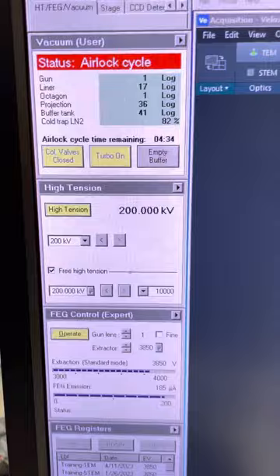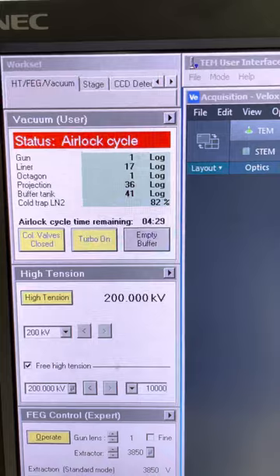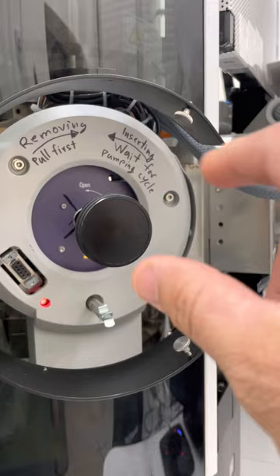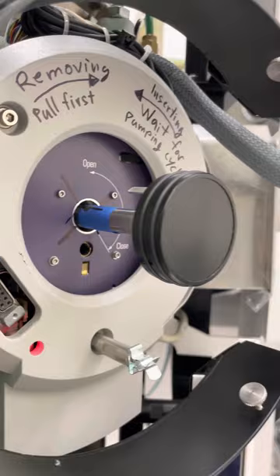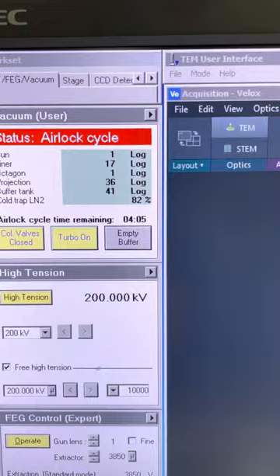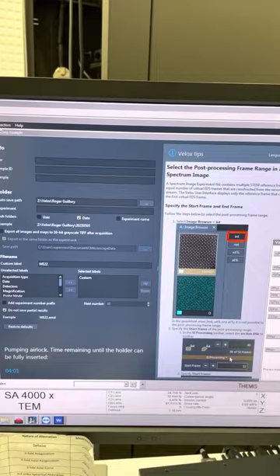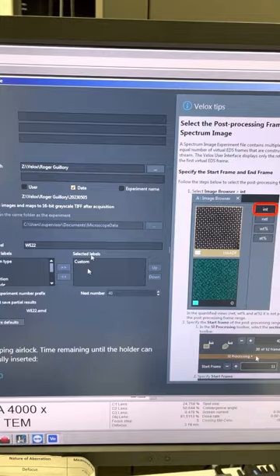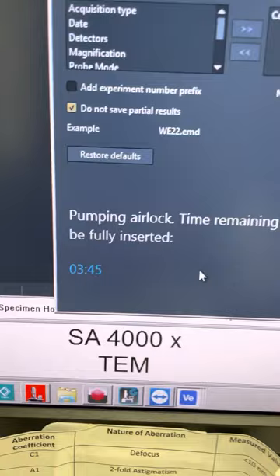Now you can see on the user interface the airlock time is counting down. We set it up for five minutes in this microscope. When the time's up, then you can go to the next step, which is rotate the holder counterclockwise. You see this countdown here for the airlock cycle time remaining. You also see here in the V-lock software. When you insert the holder, this loading sample window pops up and you can take the time to browse your folder and put your name, the name of your specimen. You also see the countdown here.